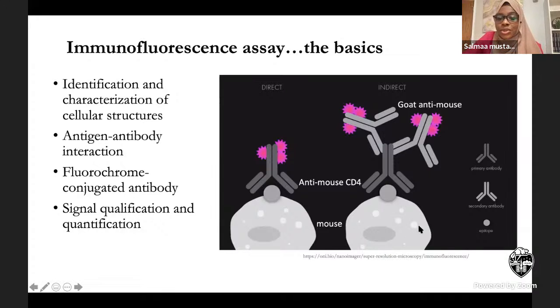For example, let's say these are two epitopes that we're looking for. This one is from a mouse cell, so it's mouse anti-X. Now you're using goat anti-mouse, and you're done. But this one is also mouse, so you may want to use rat anti-X for this protein. You cannot use goat anti-mouse for that. That's how you have to be very careful and plan your experiment right if you're staining for multiple proteins.